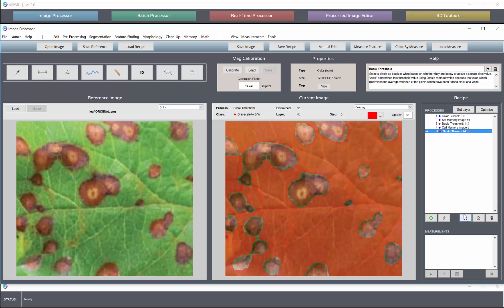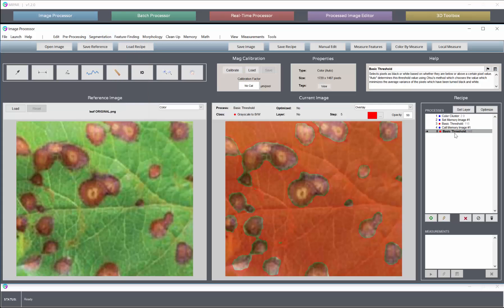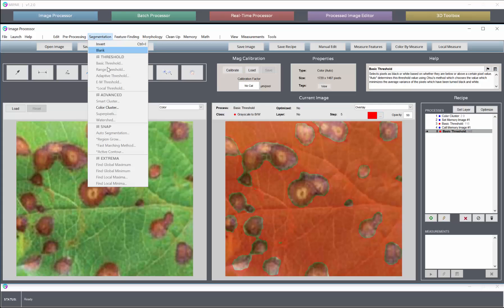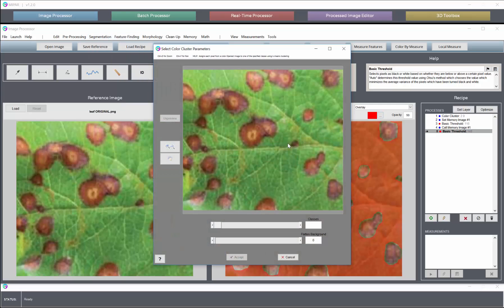So that's it. It is incredibly useful for color segmentation. Again, it draws from the original image if the original image is color. If it isn't, the tool is inactive. So even if we were down here and we did a color cluster, we'd still be pulling from the original color image.